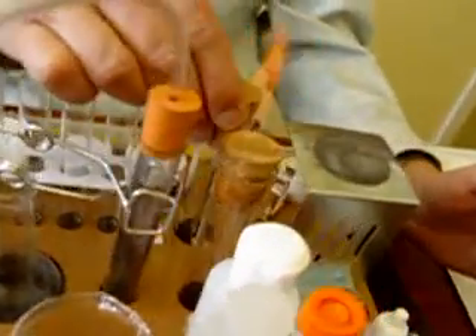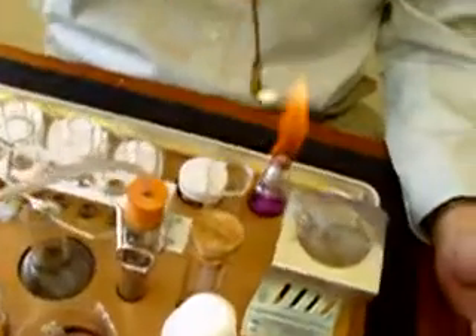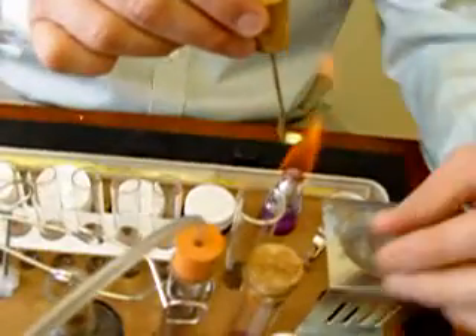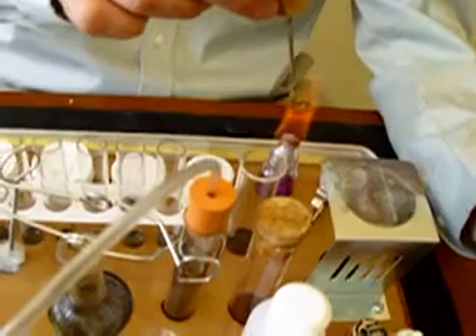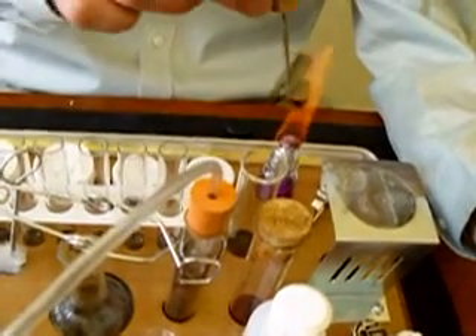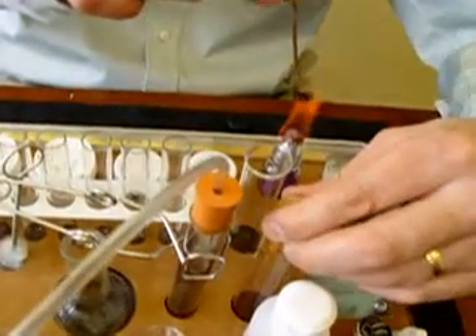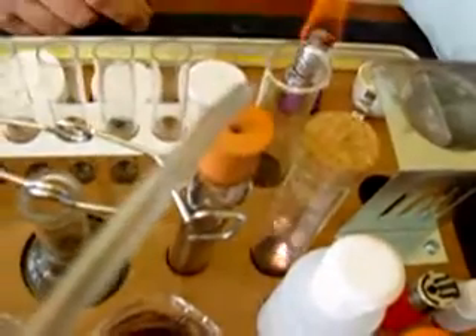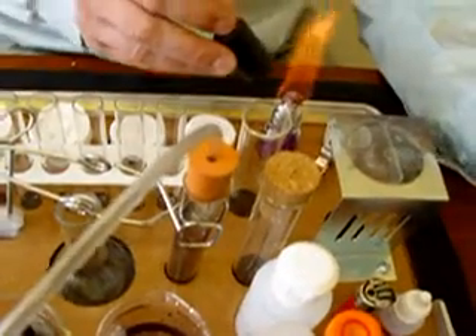Now I'm going to remove the deflagrating spoon from the other test tube, which has some sulphur on it, and start heating it. Then place that into the oxygen which we just produced. You can see it burns with a characteristic purple flame.